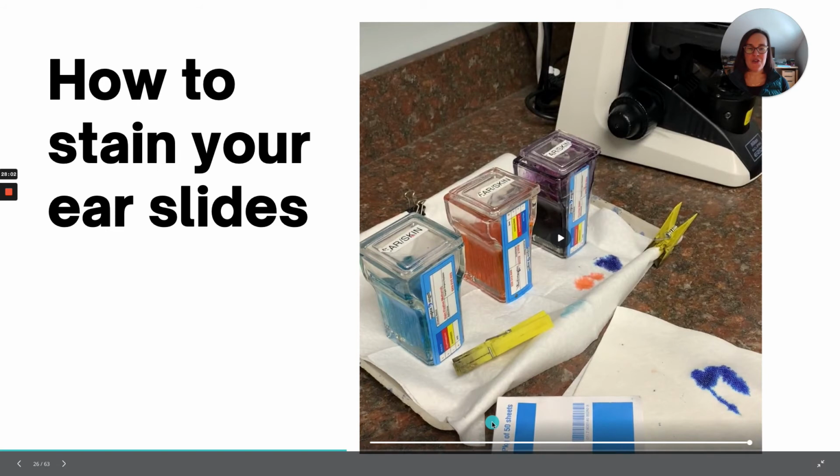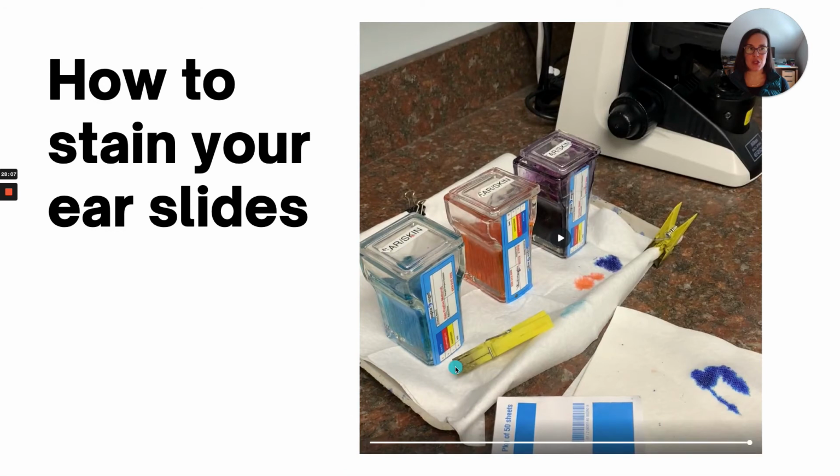So if you have a severely exudative slide for your ears, then you can do heat fixing to help get the cells to stay onto your slide. But if you have heavy exudate, there's really no way around it. It's going to sometimes come off on the bibulous paper. So sometimes just not using that and letting it air dry is what I'll do. But for a cytology like the one I collected, where it's pretty thin and it just is a covering on the slide, doesn't have a lot of pus chunks and cerumen chunks, then I feel like this method works very well for that.